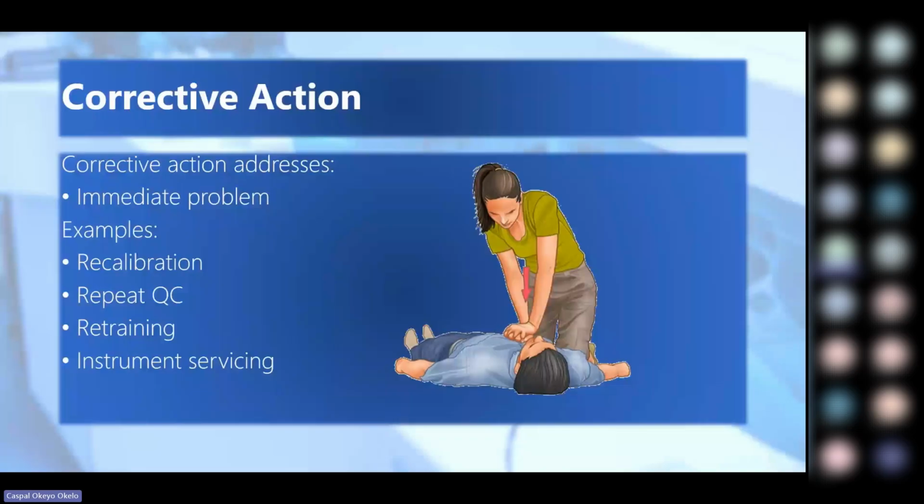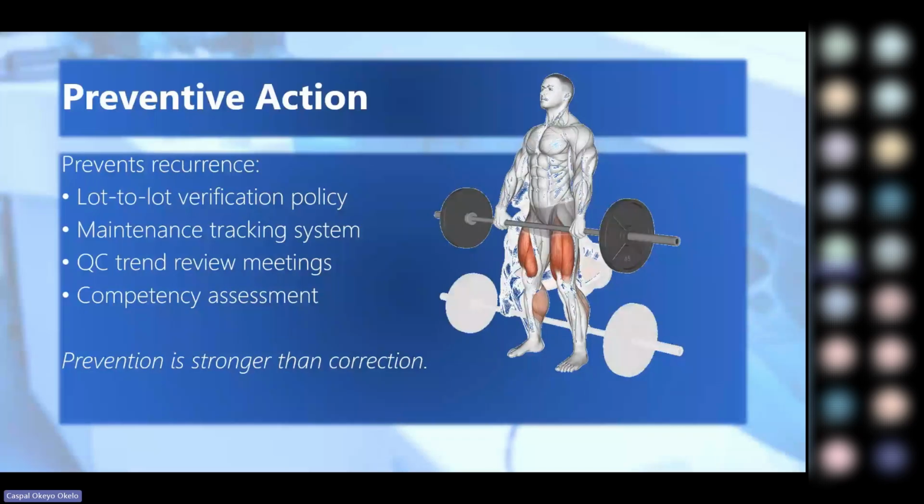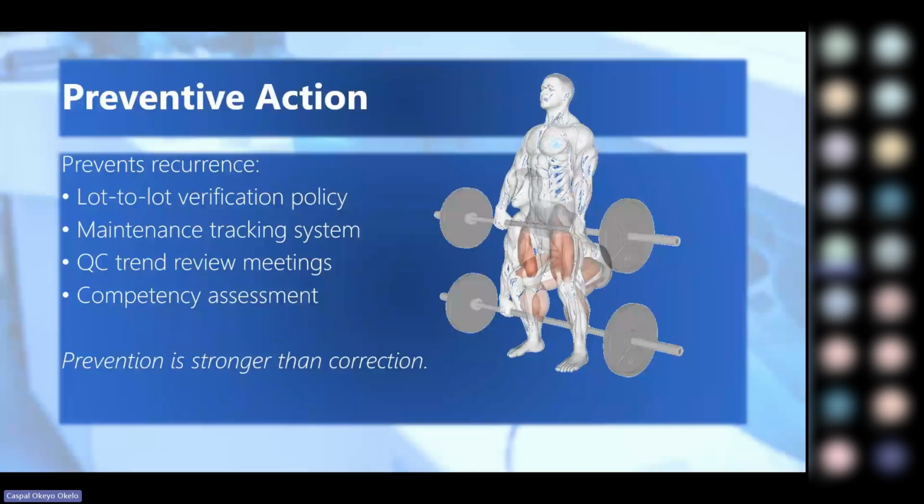We are practicing maybe rescue. And in quality management, corrective action is rescue. It is necessary, it is urgent, and it is life-saving. But corrective action is incomplete. And that is why preventive action exists. Preventive action is like healthy living, if corrective action is CPR.